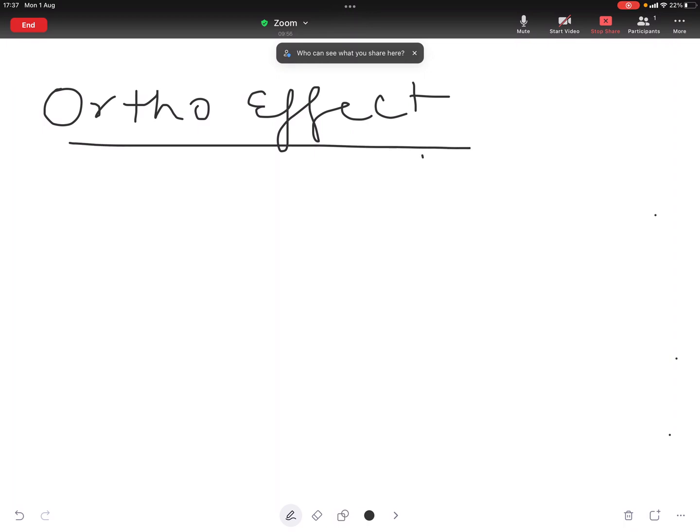Molecular ion of methyl salicylate undergoes a rapid loss of methyl alcohol through a 6-membered transition state to form a species whose m/z is 120. This type of transition state is characteristic of benzoic acid and benzoate ester that has an ortho substituent bearing an alpha hydrogen, and this is called ortho effect.